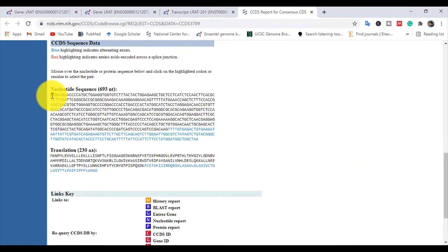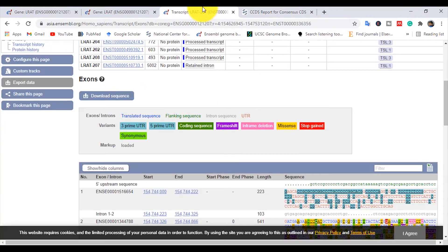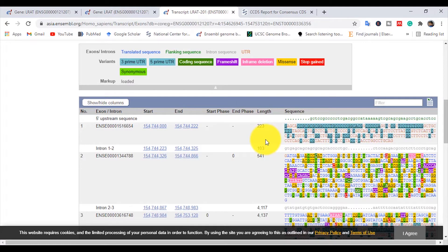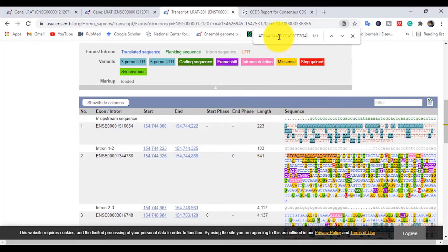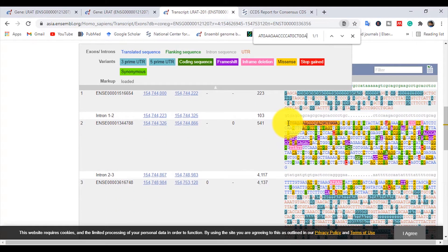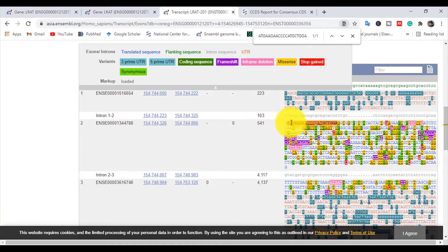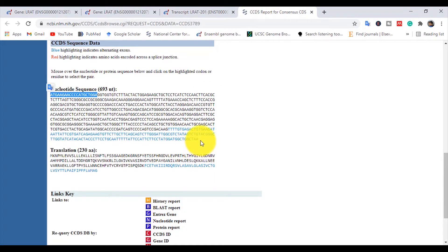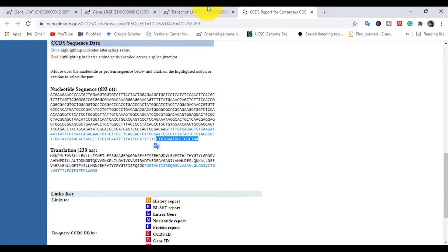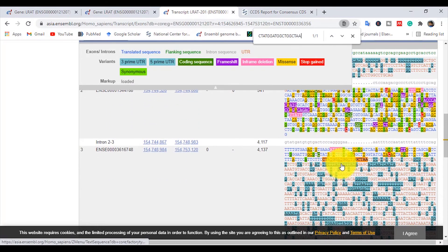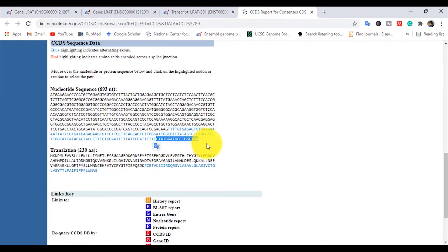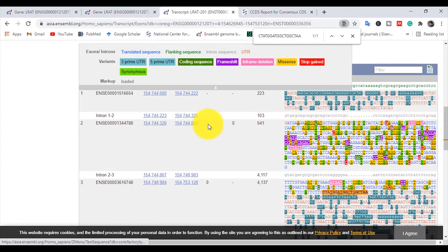I copy some nucleotide sequence using Ctrl+C, then use Ctrl+F to find that nucleotide sequence and Ctrl+V to paste it. You can see the first exon starts here in this region. I also copy some nucleotide sequence from the end of the gene to find where the exon ends. So this gene has three exons, and you can identify their specific positions this way.